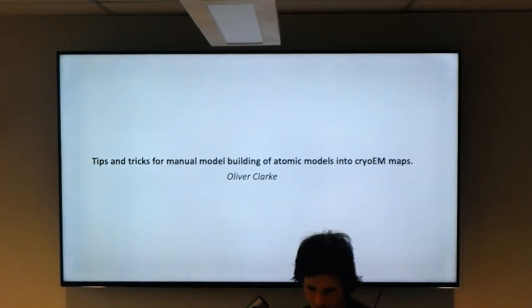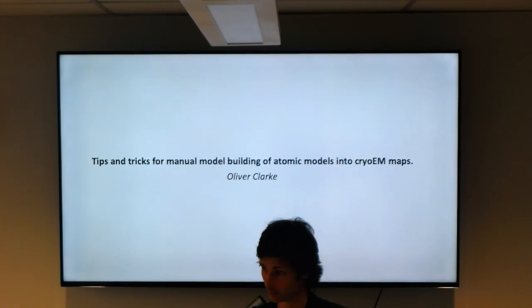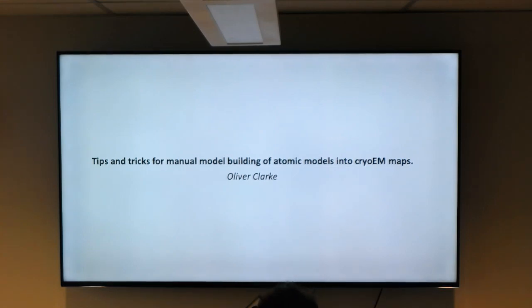All right, thanks very much, Laura. So this is going to be pretty informal. I just want to give you guys a guide to what to do when you start with basically a map and a sequence, and you want to figure out how to generate the best possible model that fits your map, your density.